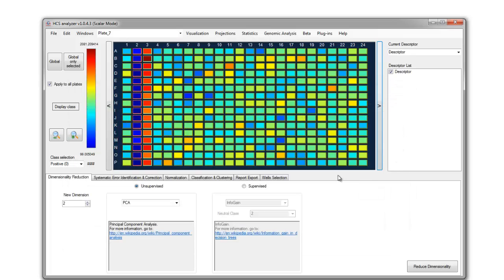So this is how you can generate your univariate screening. During the next tutorial we will take a look at how we can generate a multivariate screening.